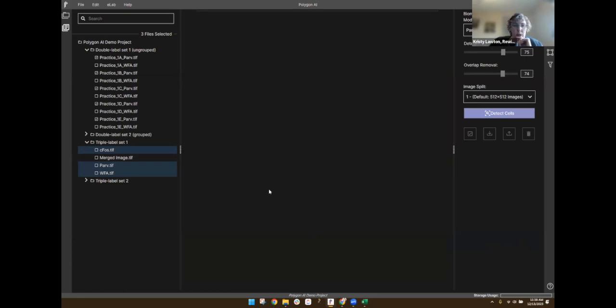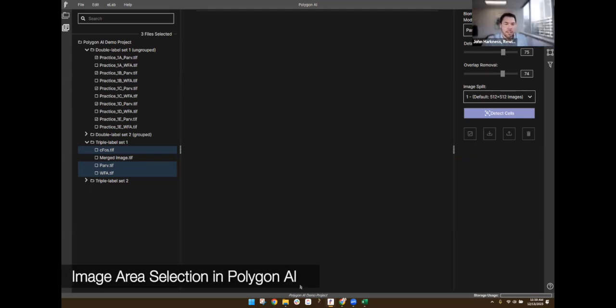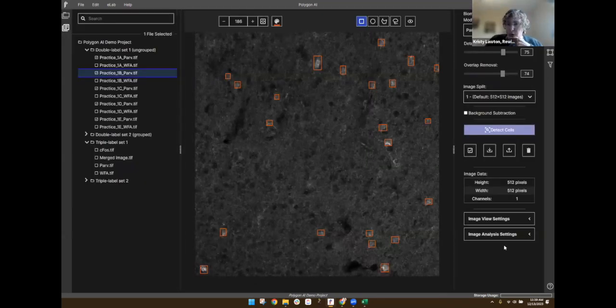I think we can go ahead and start the Q&A in earnest. Great. Yeah, we've had a couple questions in the chat that we've been going through. One thing that did come up, Christy, that you might have a chance to walk through now is the area selection function in analysis, showing how to select just a region of the image that you'd like to contain analysis within. Yeah, that's a nice feature, for sure.